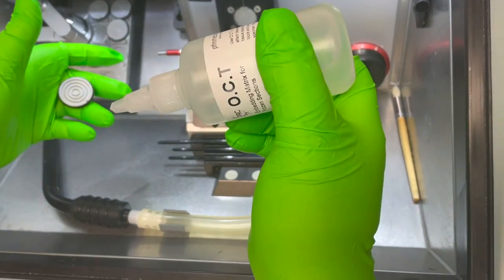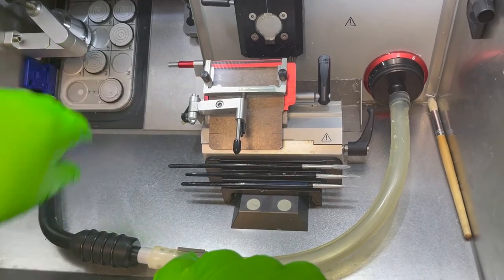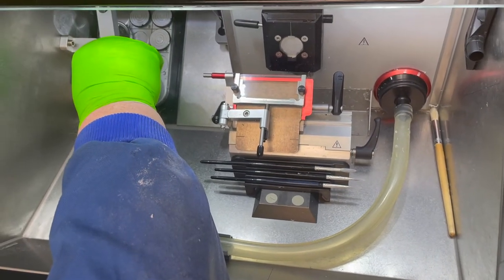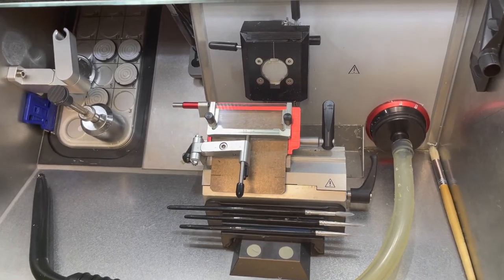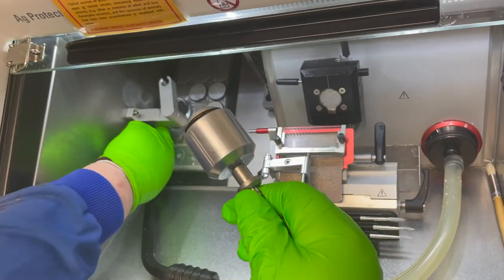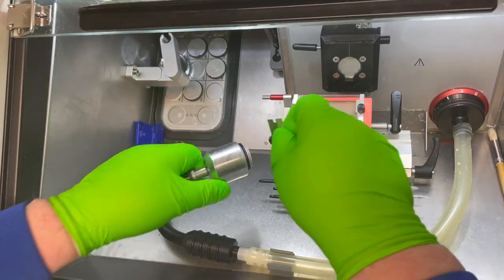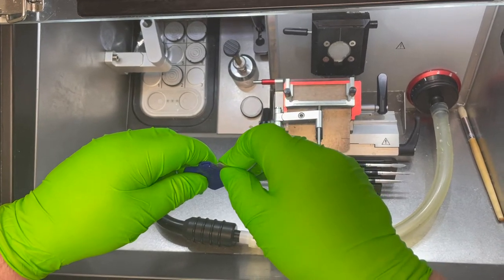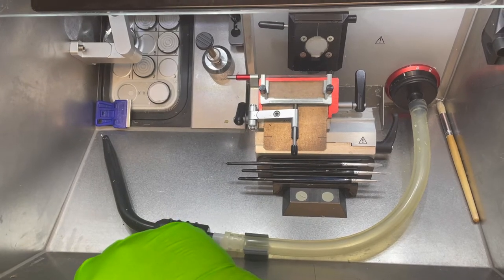I'm going to apply some OCT to the specimen head. There's a variety of ways of doing this. You can flatten it and freeze it — that will give you a good base to stick things on to. This is a single-sided razor blade, and I've got cut-resistant gloves on underneath these nitrile gloves. There we have a nice flat OCT that's attached well to the objective head.